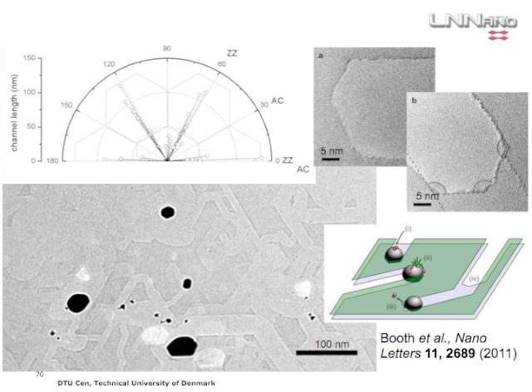This is an analysis of a post-treated sample. And you can see that the channels are at angles of 60 degrees to each other. The further you go from the sensor here, the longer the channel. But you definitely see that they are at specific angles. And you can also see that here. That's of course because the silver particles follow the crystalline structure of the underlying graphene. You can also see here individual channels where you clearly see these 120 degree angles.